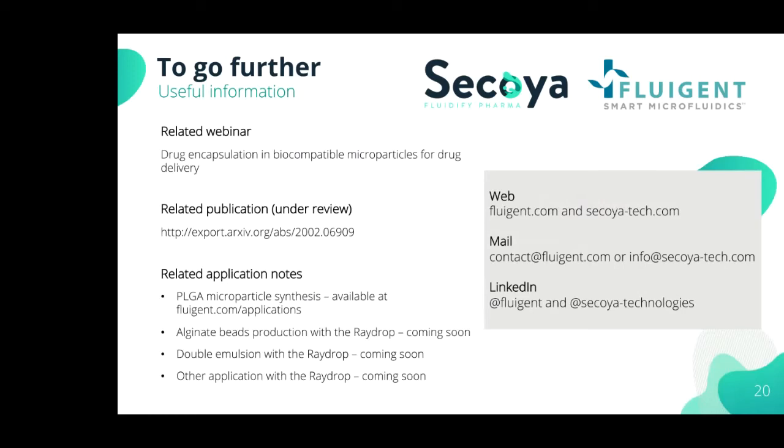Are you using flexible tubing for this? Yes, actually, we connect the Raydrop using flexible tubing, using standard Upchurch fittings. But inside the Raydrop, we only use glass capillaries coated with Kapton, a polyimide film, to increase the durability. We cannot use flexible tubing inside the Raydrop because we need alignment, and you can only get alignment using a rigid capillary. But this capillary is very short: about 2 centimeters for the input capillary and about 2 centimeters for the output capillary, and the rest is classical tubing, PTFE, whatever you want.